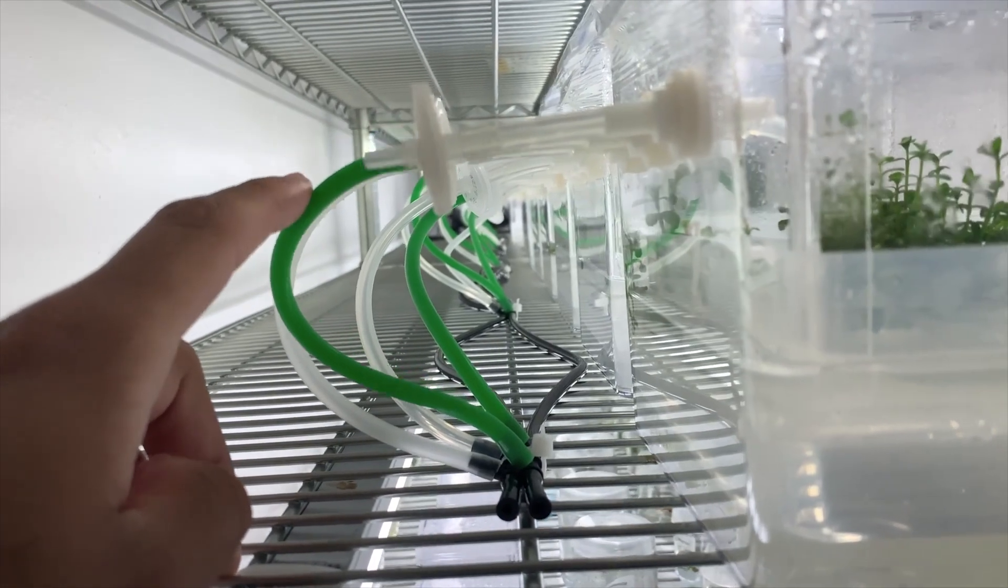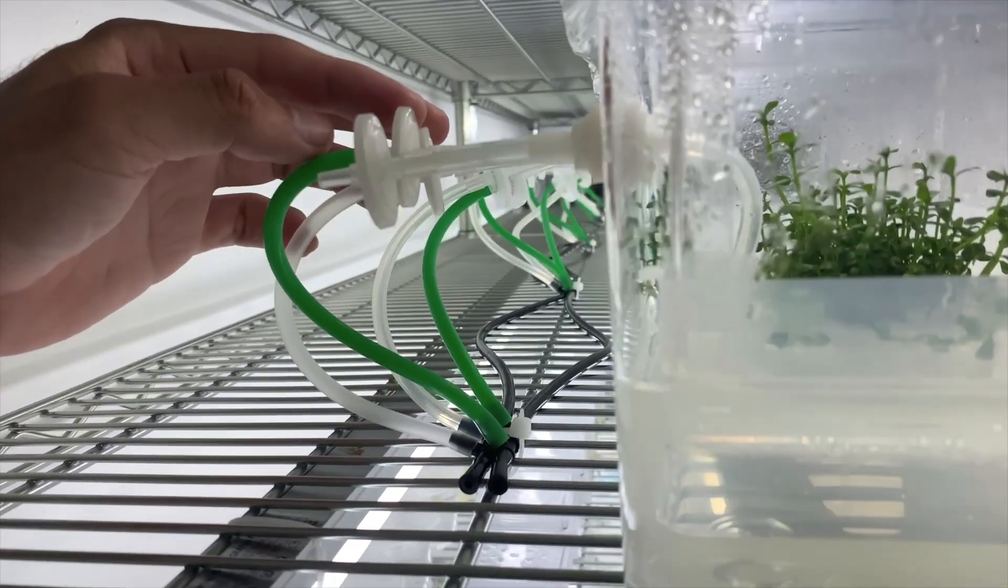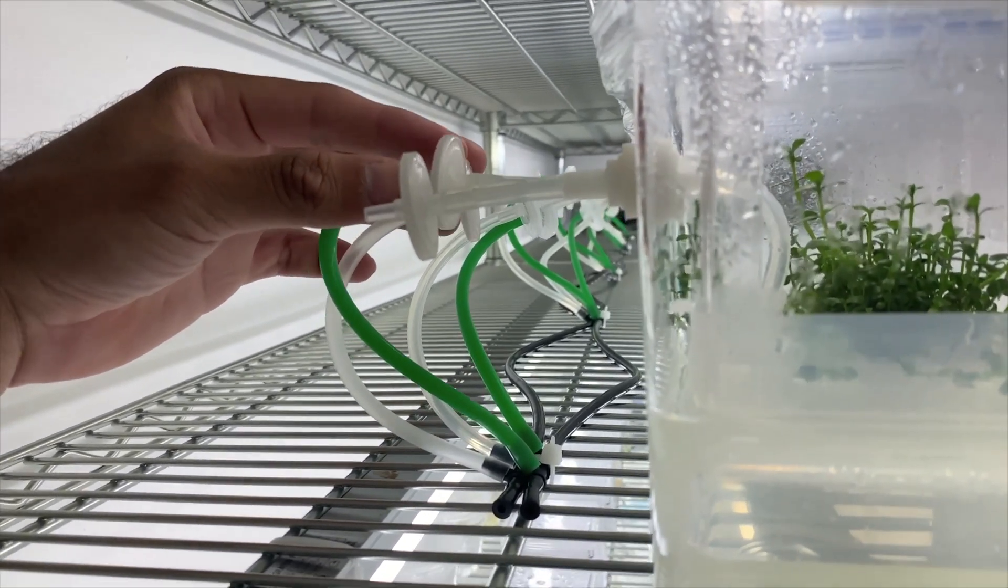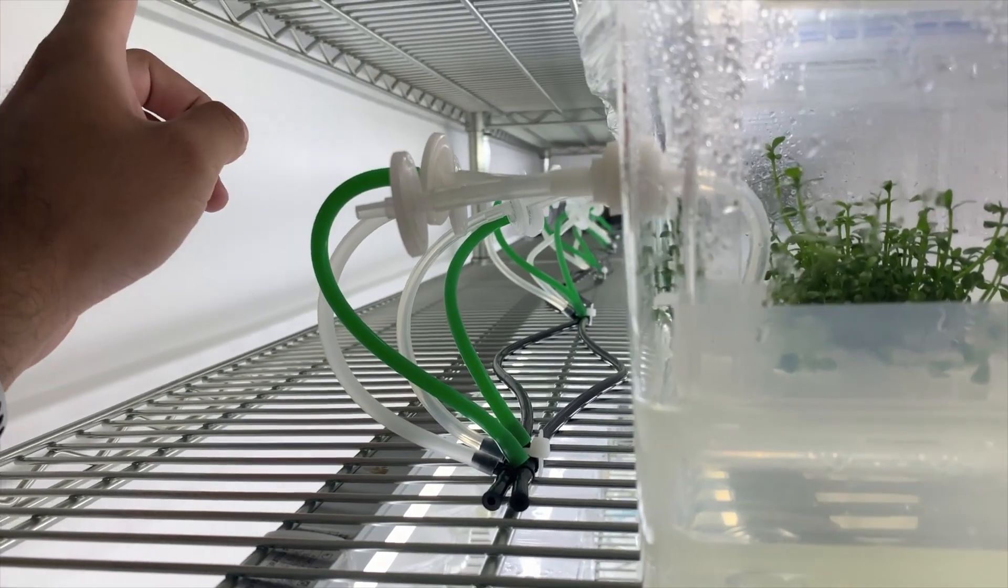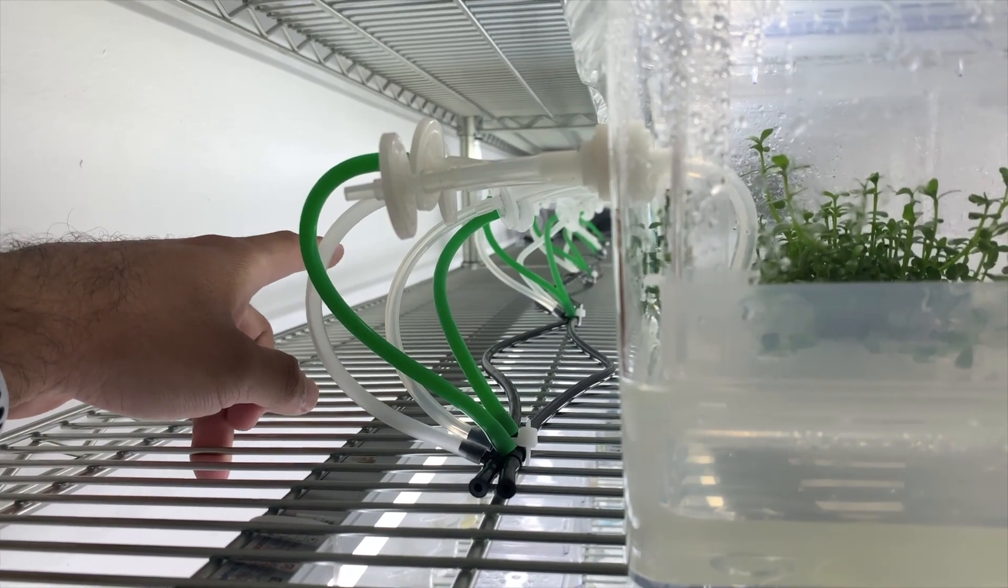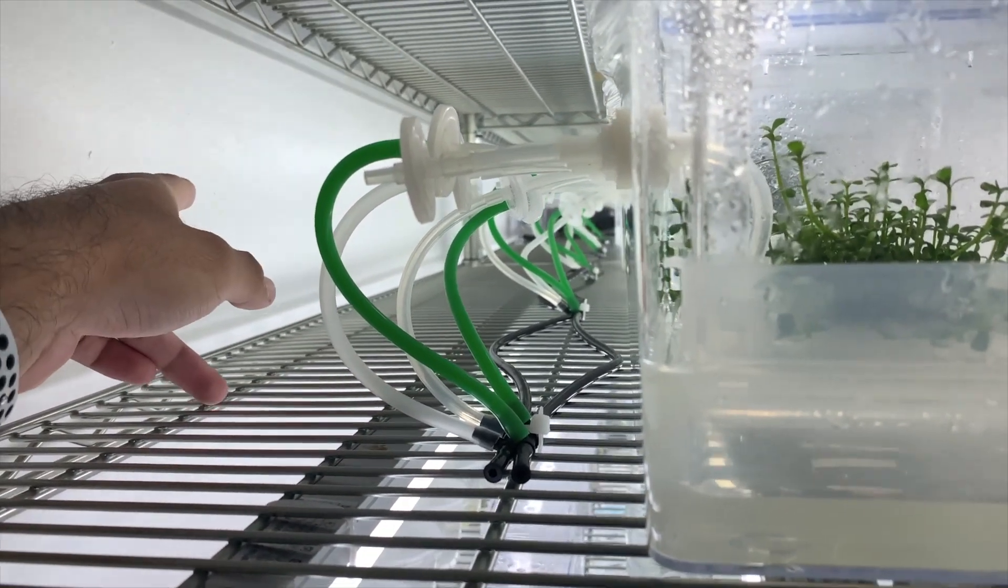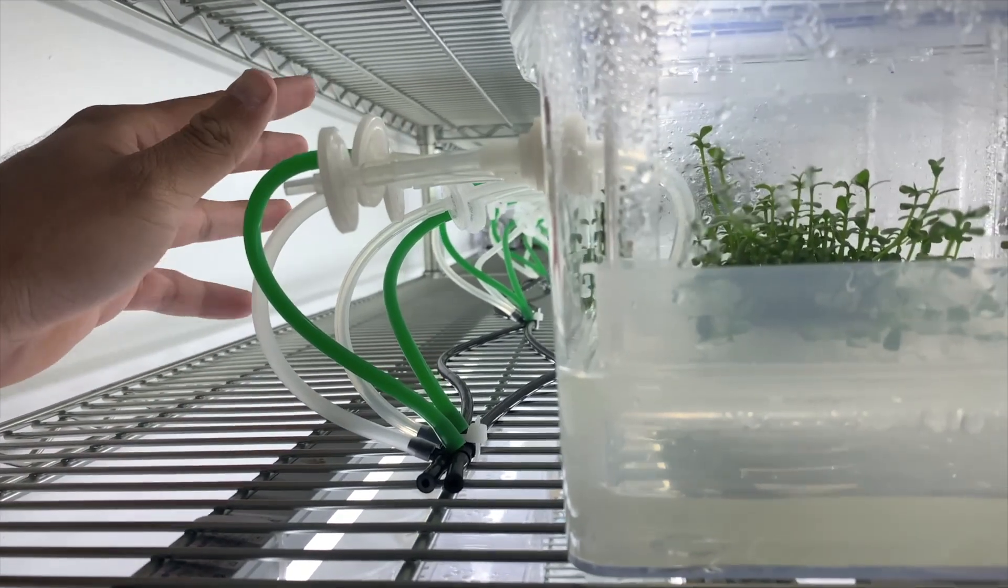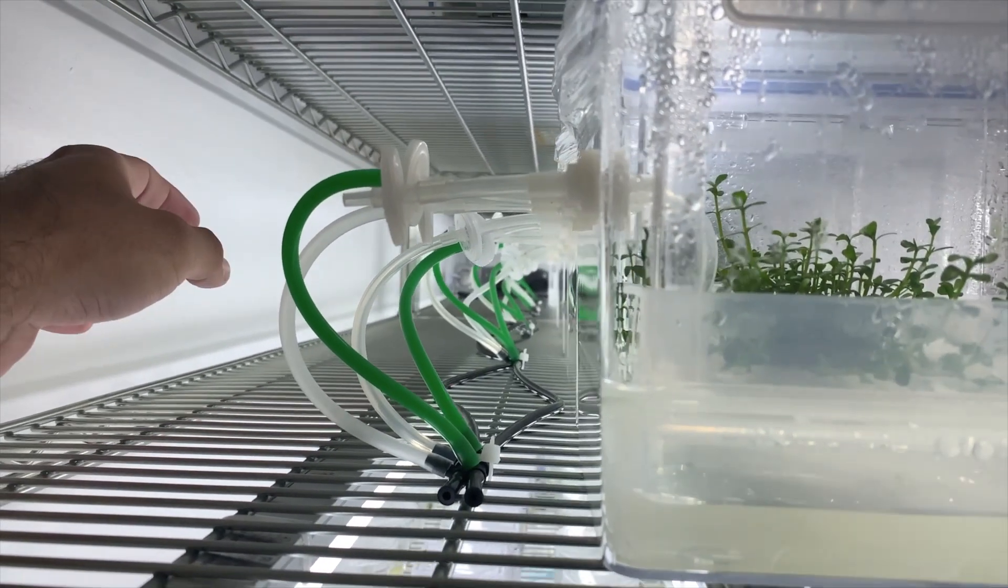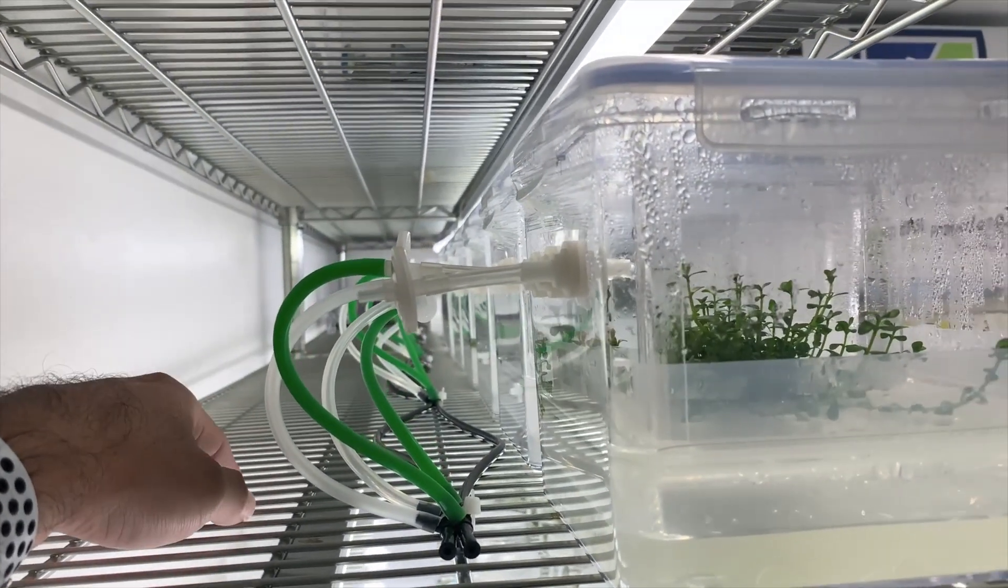If you have two filters set up for twin bottles, you will use either a three-way solenoid or two pumps. I'm still trying to figure out how to make it work. I think I can make it work. However, I'm still trying to find some of the materials that I need. Hopefully that will come up soon.